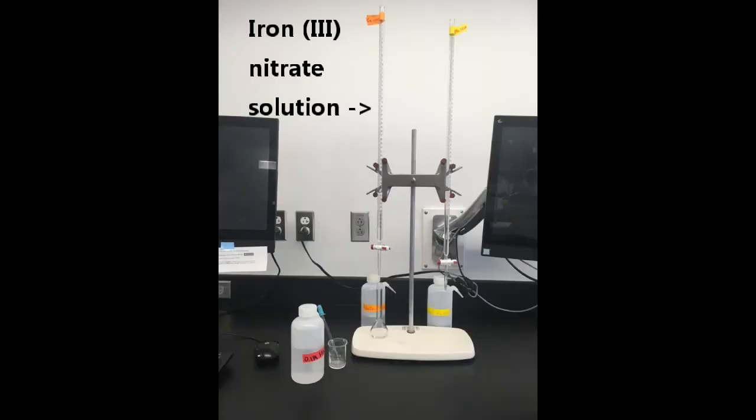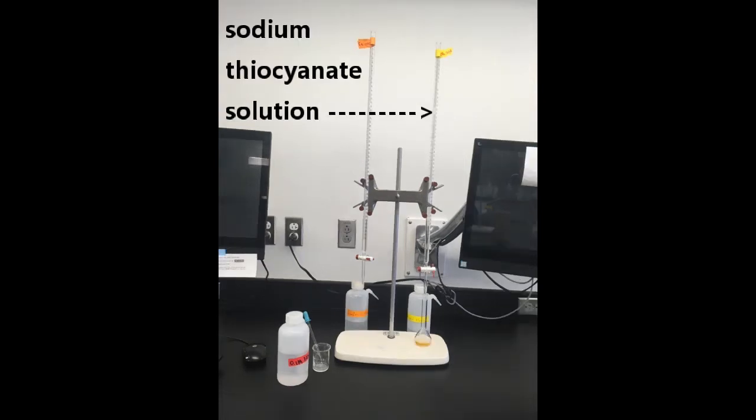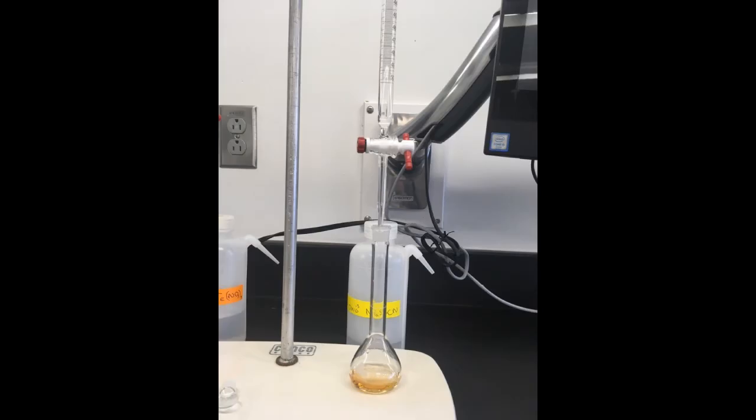Follow the procedure as written. Use the dispensing burettes to dispense 20 ml of iron(III) nitrate and 20 milliliters of sodium thiocyanate into a clean 50 ml volumetric flask. The orange color should be apparent immediately upon mixing of the two reactants.